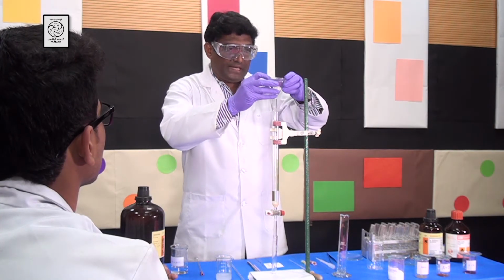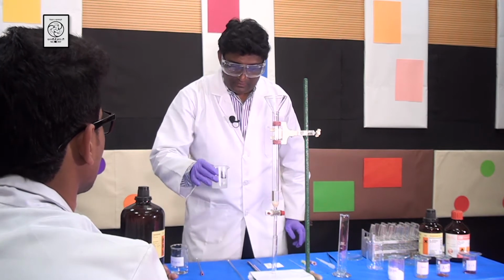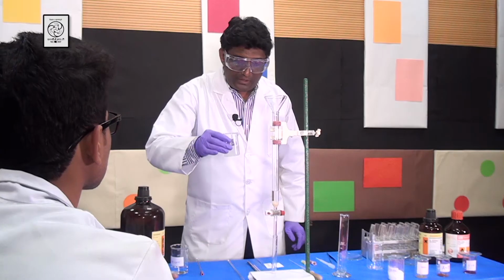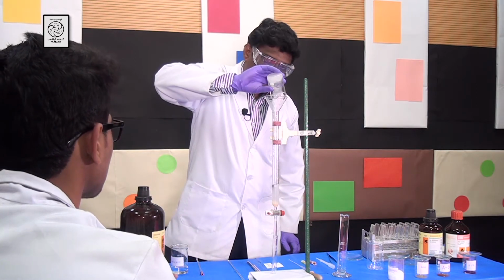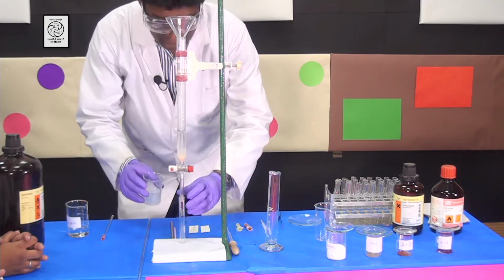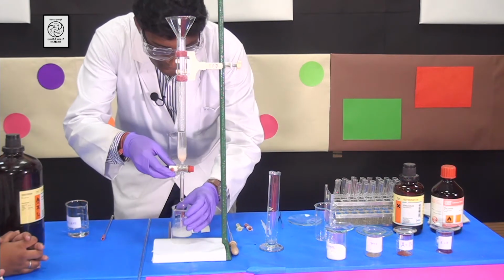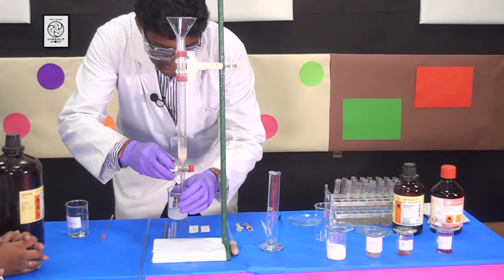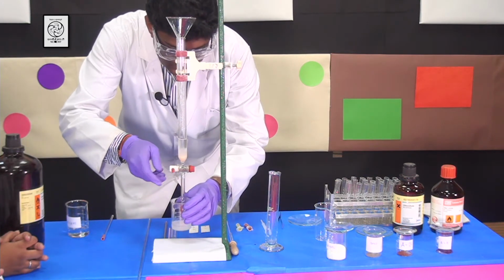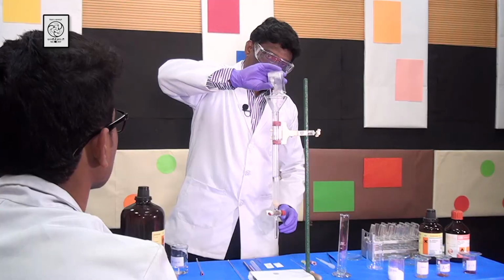I am putting the glass funnel on the top of the column nicely. Now at this part you have to do it a couple of times. Then we can collect the solvent, then you can pour it back.